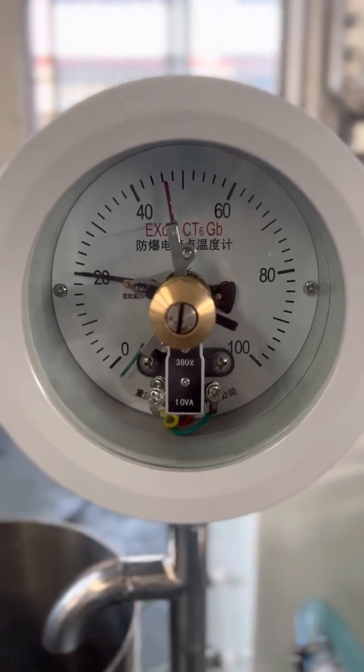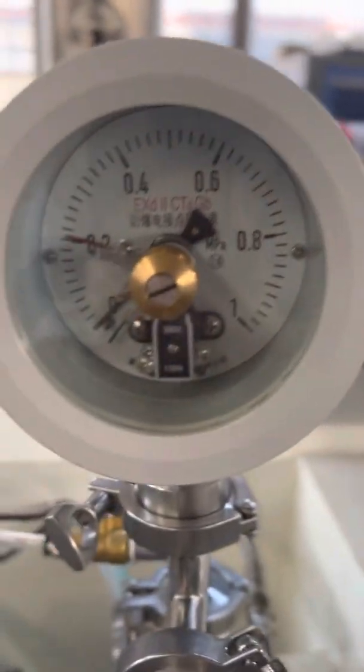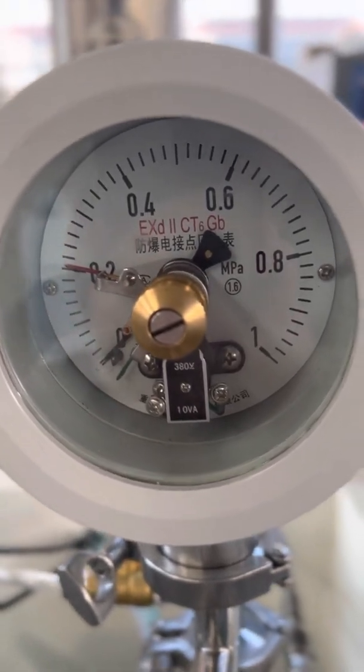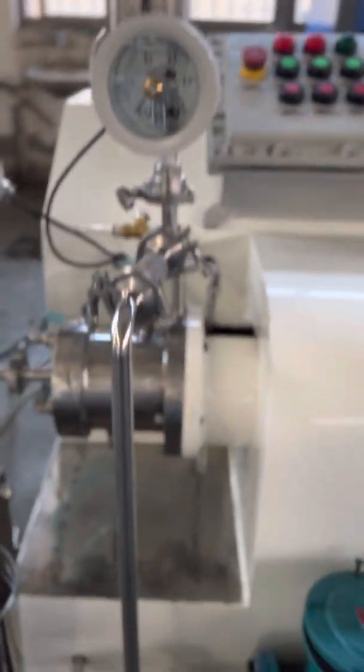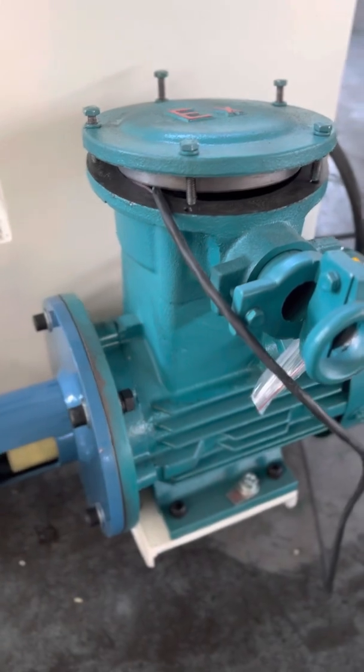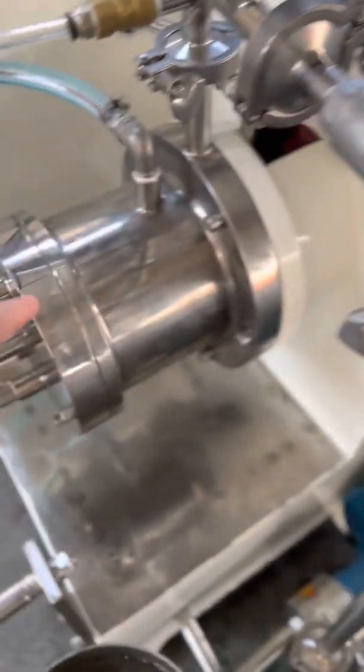Electric contact temperature meters, explosion-proof, and electric contact pressure meters, explosion-proof. The feeding tank is connected to the feeding pump. Here is the gear pump and the feeding pipe to the grinding chamber.